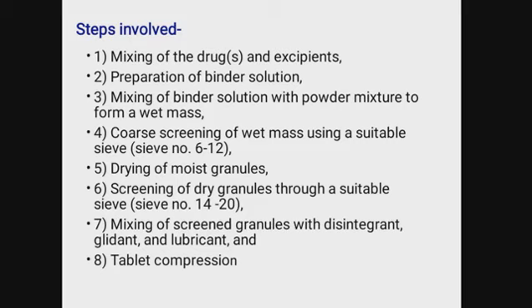The sixth step is screening of the dry granules through a suitable sieve, that is sieve number 14 to 20. Our seventh step is mixing of the screened granules with disintegrant, glidant and lubricant. And the last step is tablet compression. These are the steps involved in wet granulation.